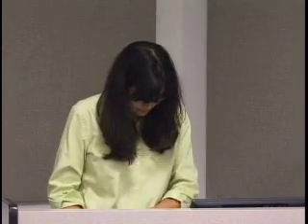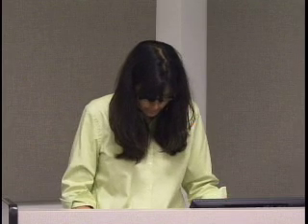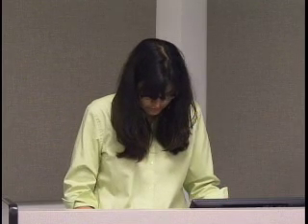So what we're going to do now is go into the laboratory, and the first thing we'll do is, you can sit anywhere. I'm going to put you in groups, but for right now, you can just sit anywhere, and we're going to start preparing our slides. And then while we wait for those to dry, Andy will go over some of the instrument components.